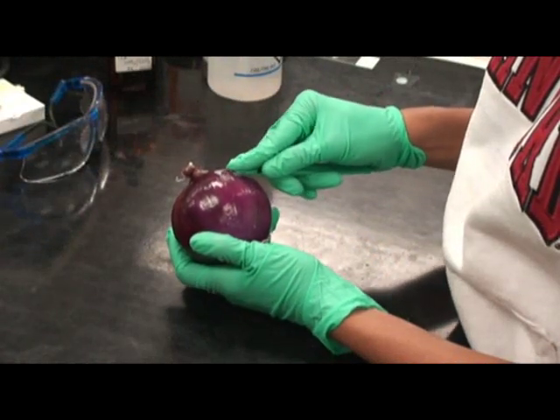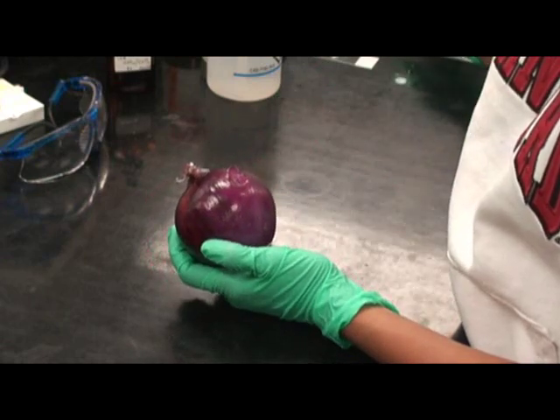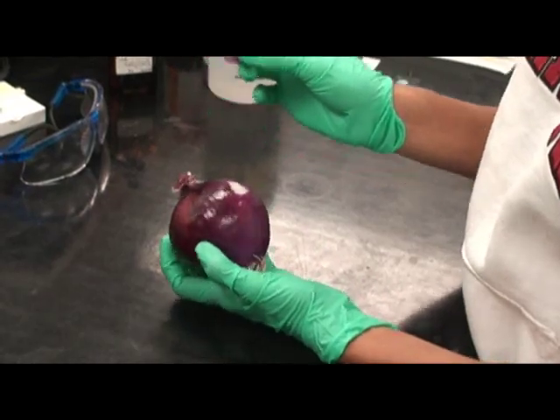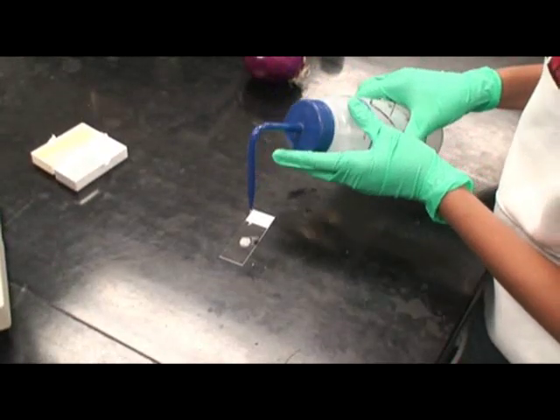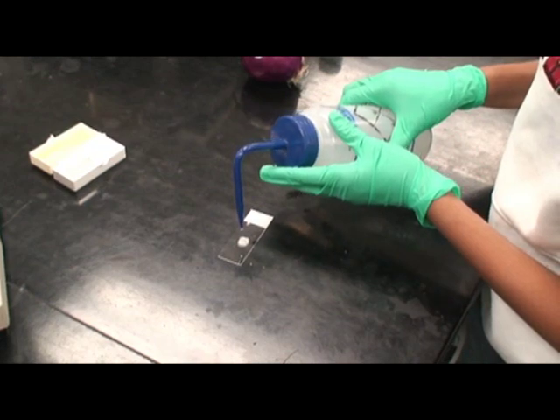Prepare sections of the outer epidermis of a red onion bulb by peeling a thin portion off one of the leaves with a razor blade. Place a section of the peeled onion on a slide, add a drop of water, and a cover slip.